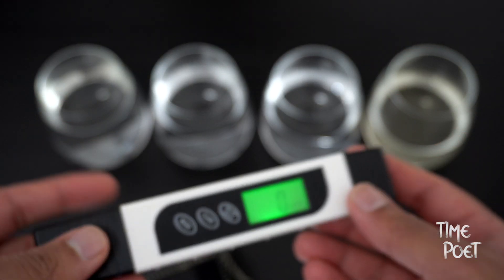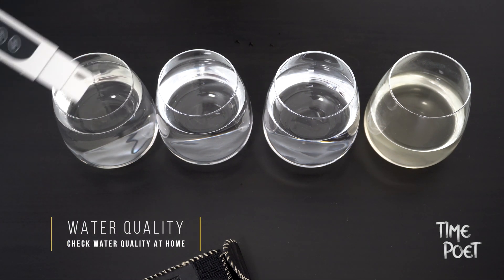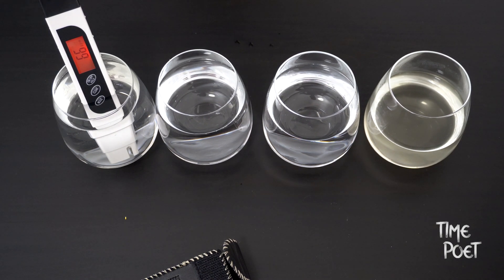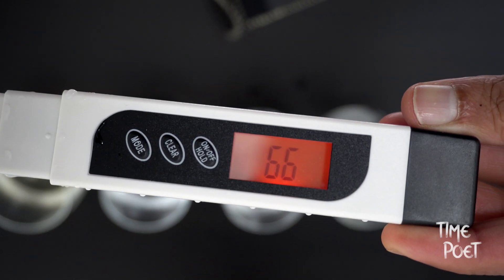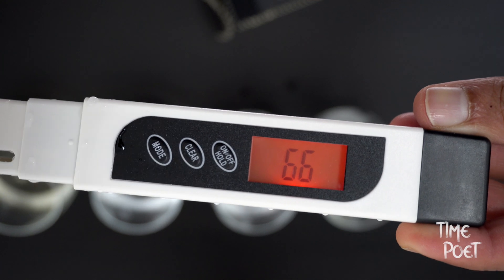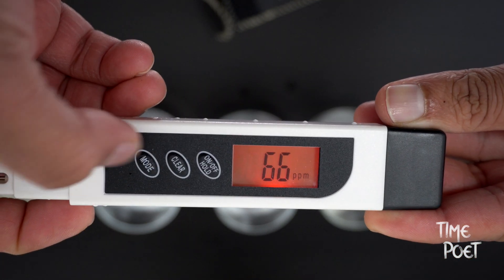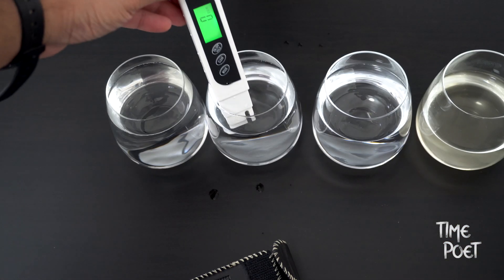Let's test the TDS values for each of the samples, starting with the tap water. Almost instantly I've got a reading of 66 — more dissolved solids than expected, but maybe a simple water filter can bring this value down. Let's clear it and test the next one. Looking at the filtered tap water, it's given me a value of 41.